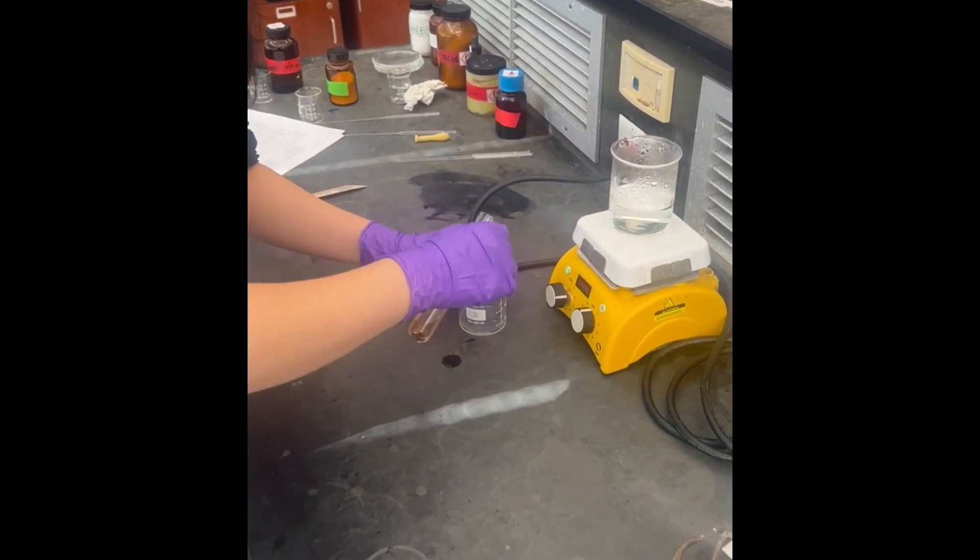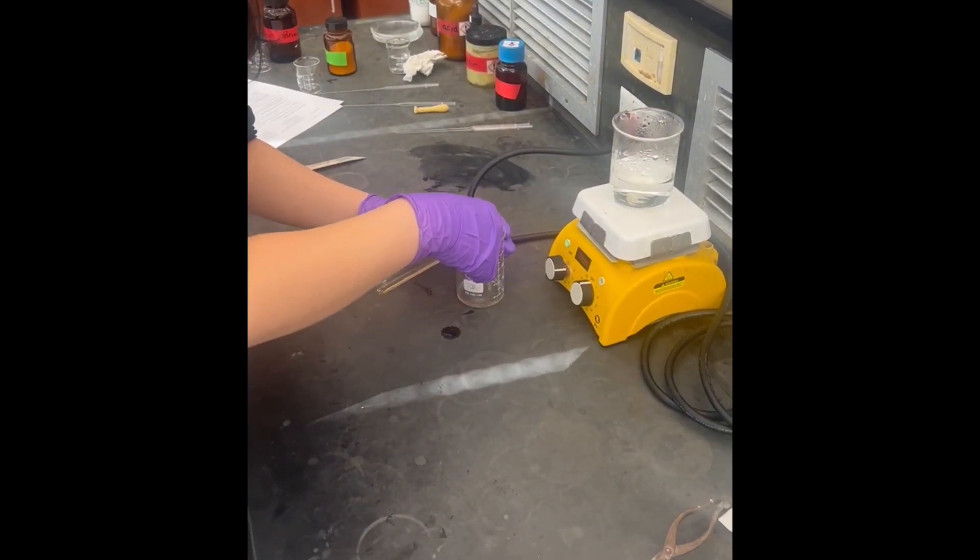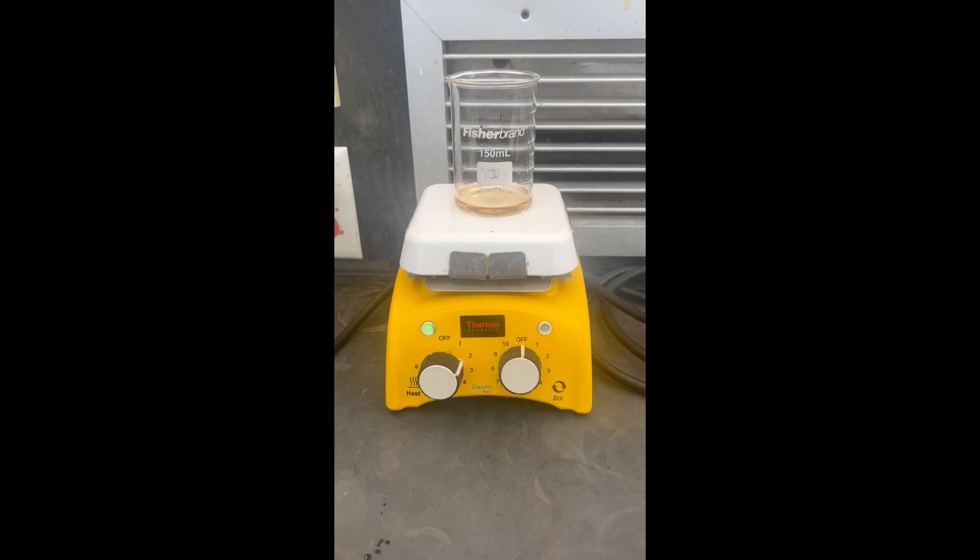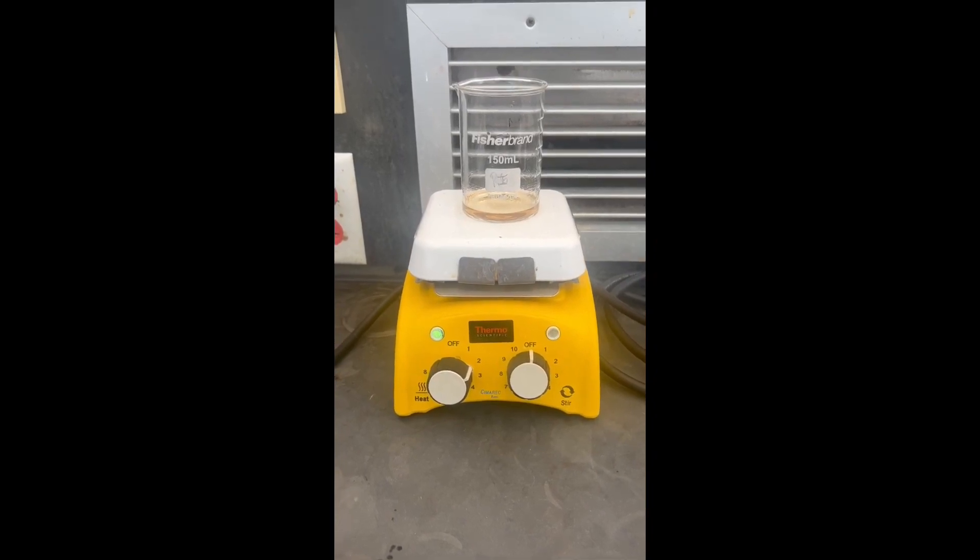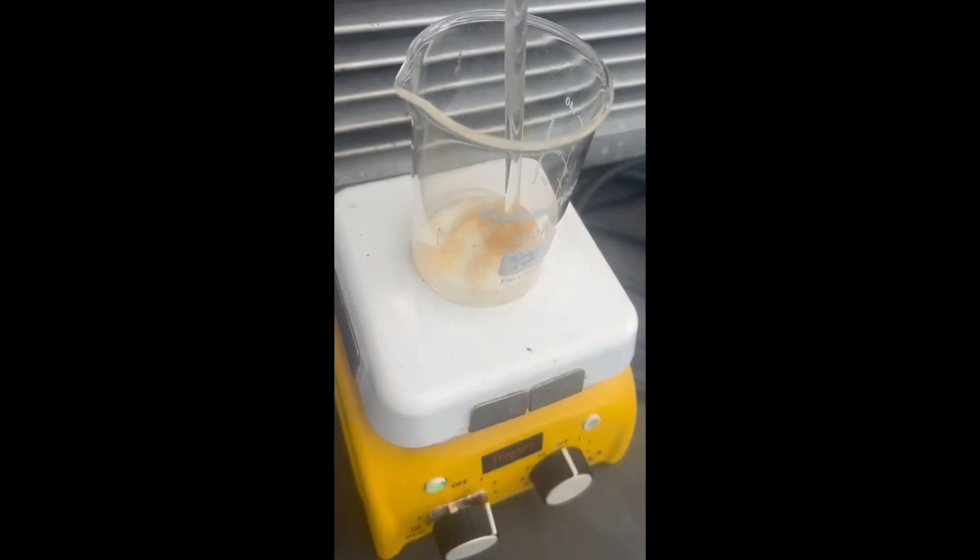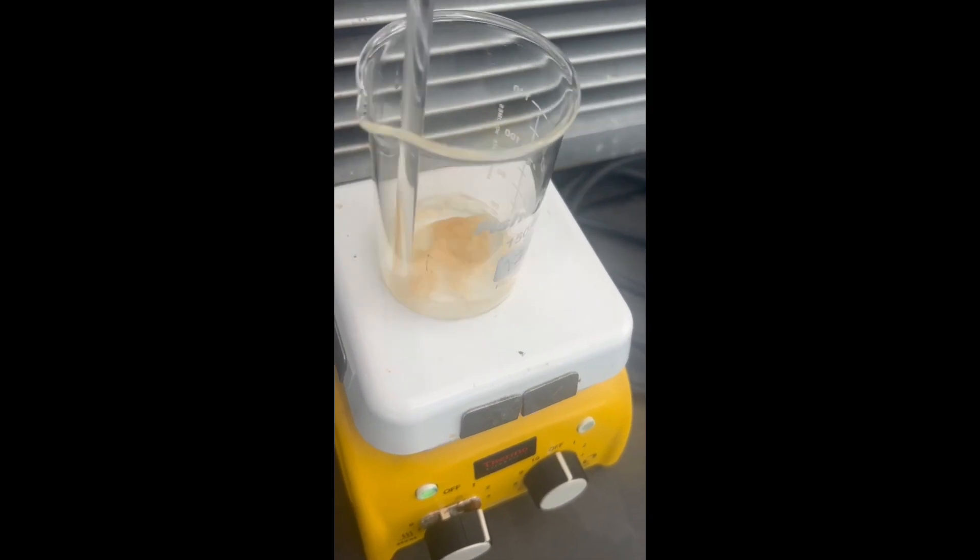Pour contents into a 150 milliliter beaker and place it on a hot plate for the alcohol to evaporate and the remains to become thick and sticky. Do not overheat or it will char.